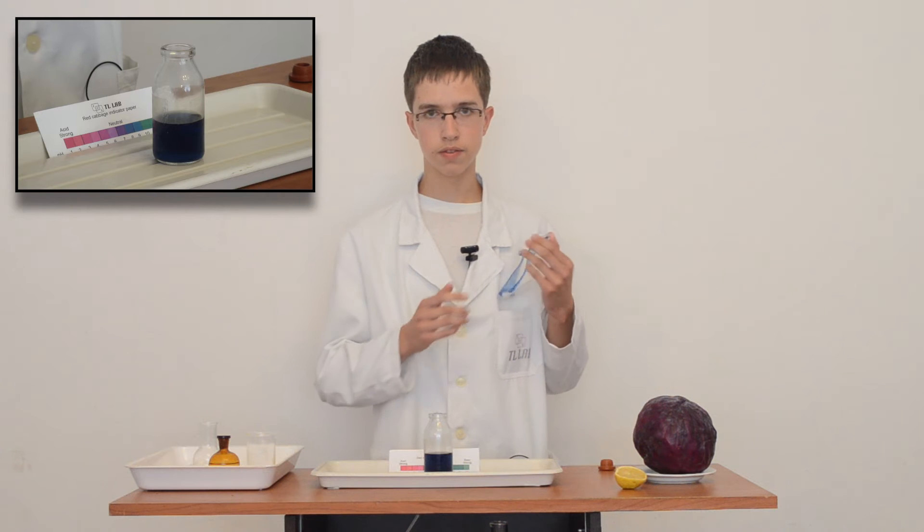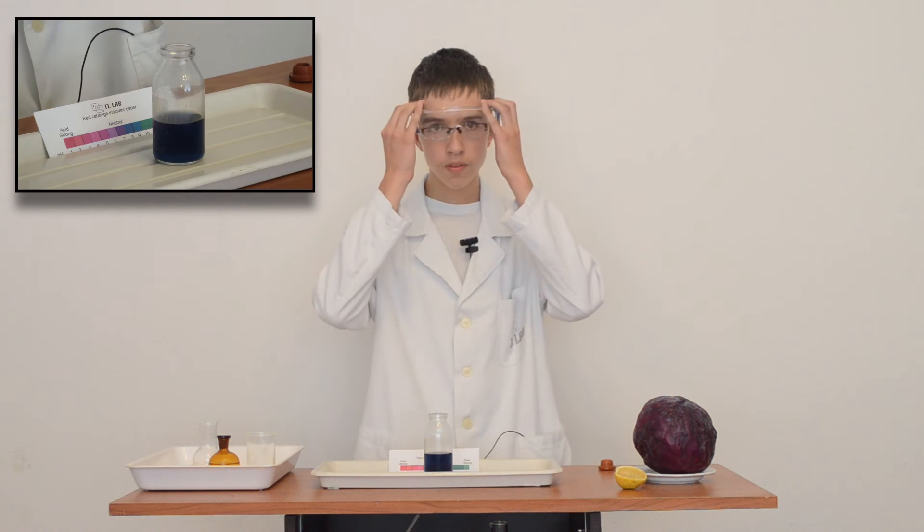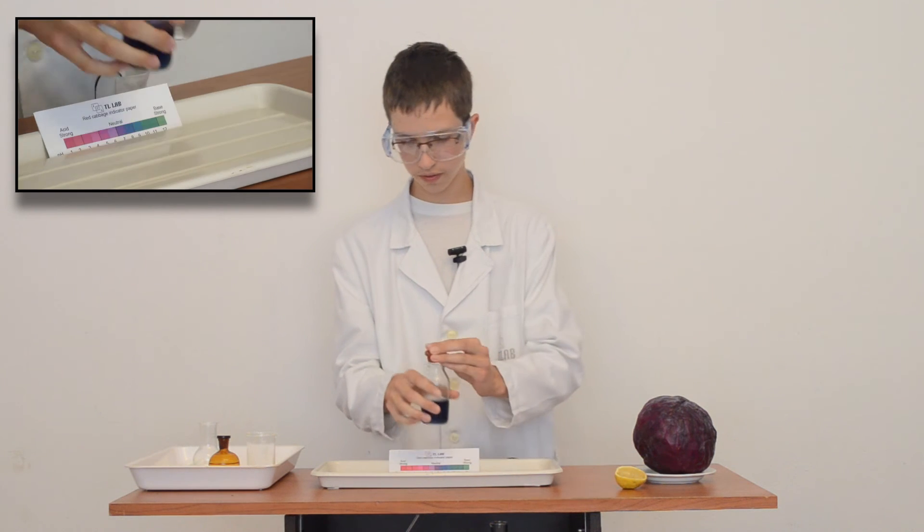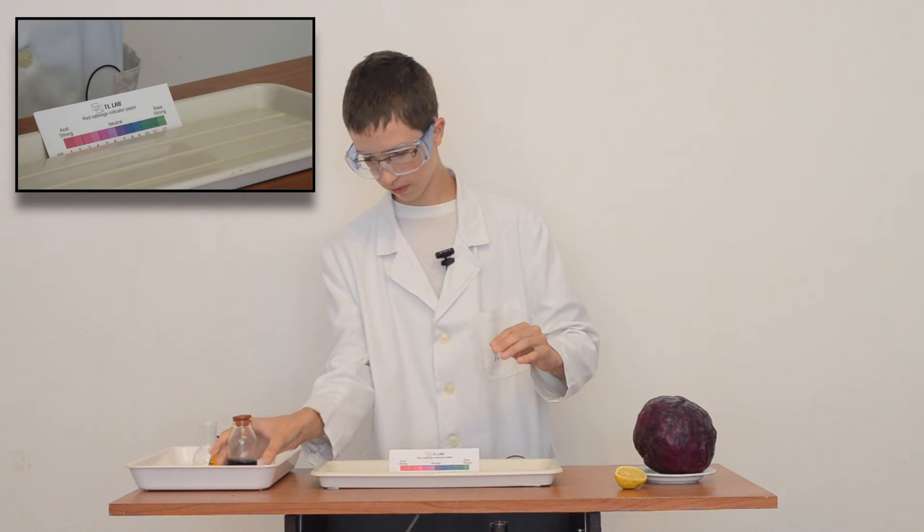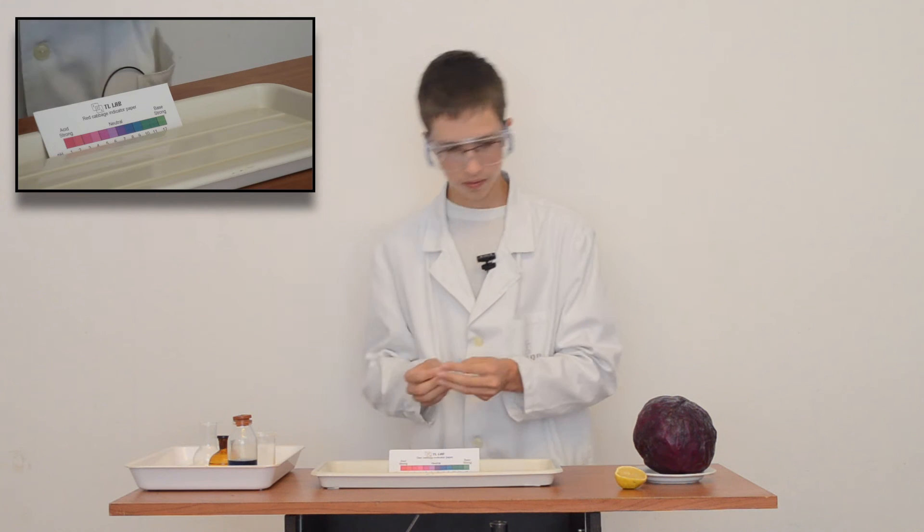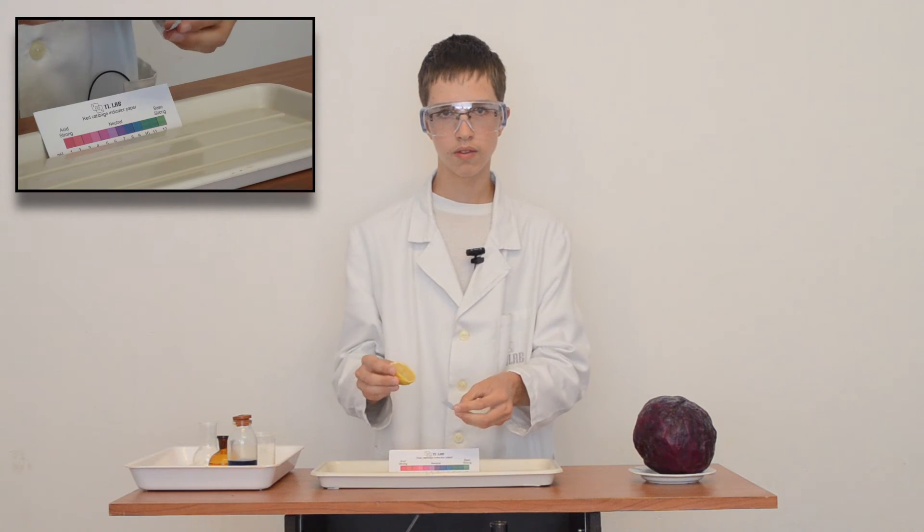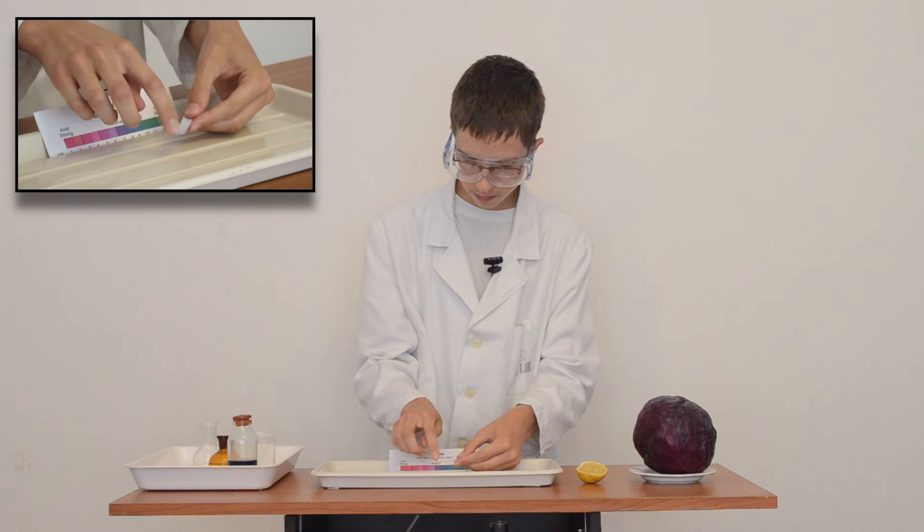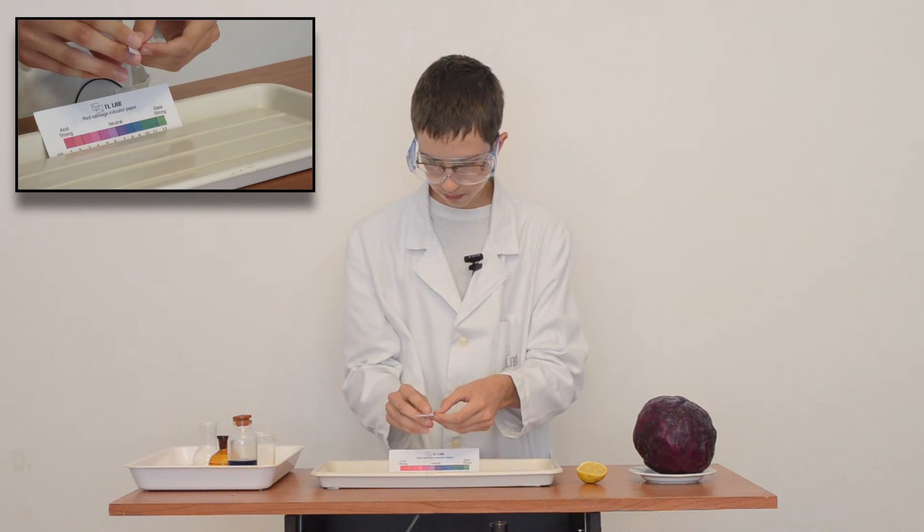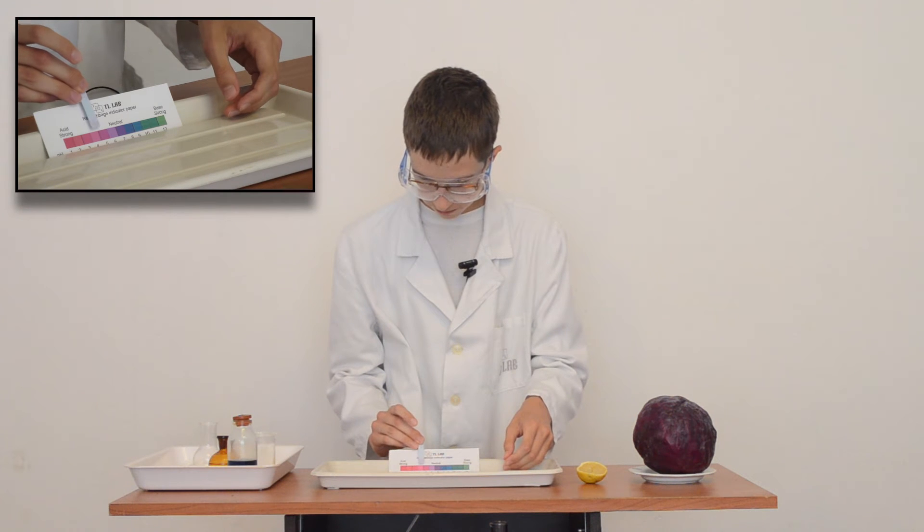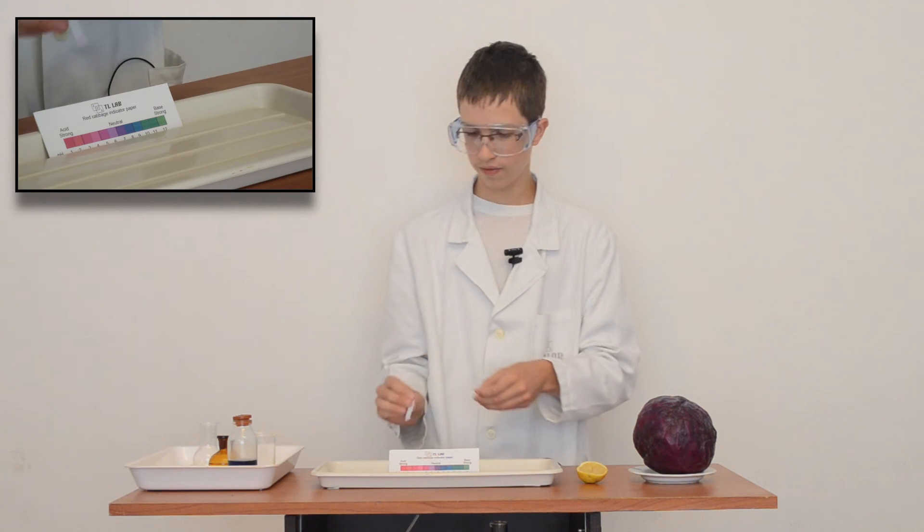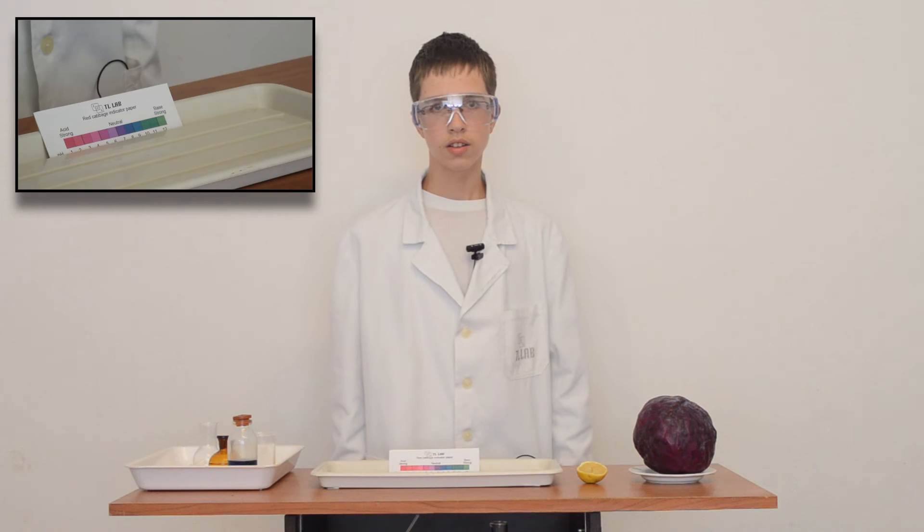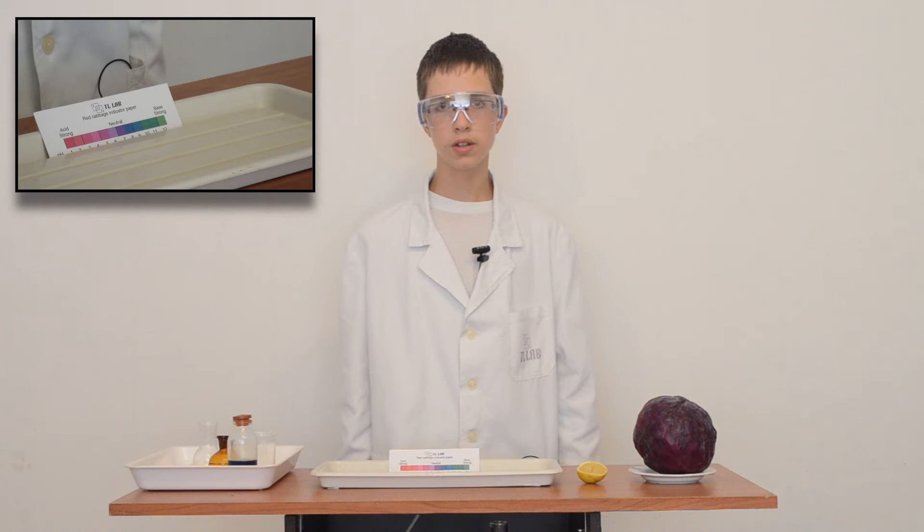First I'll show you how litmus paper reacts on acid from lemon. We can see change in color. And now you'll see a few examples with indicator liquid.